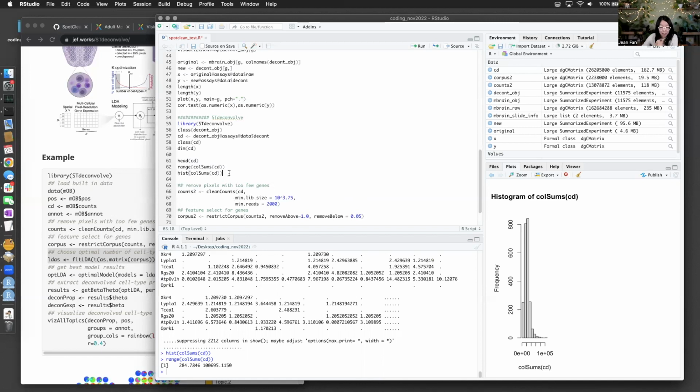So how do we get integer counts? I guess we could floor it. If you have 0.2 of a gene, it's like having 0. If you have 0.9, you don't have another copy of the whole gene. I'm just theorizing, but why don't we do a floor? That will make all the points a lower number. You could also ceiling, or just round. But I'm going to floor, and leave it as an exercise for viewers and students to try round.